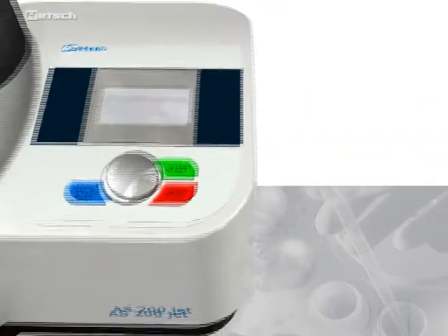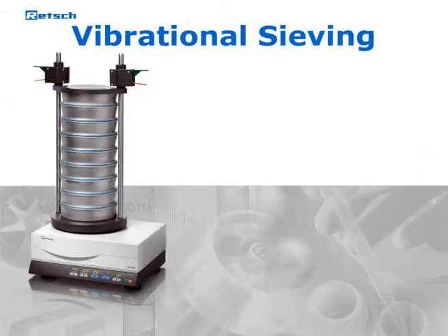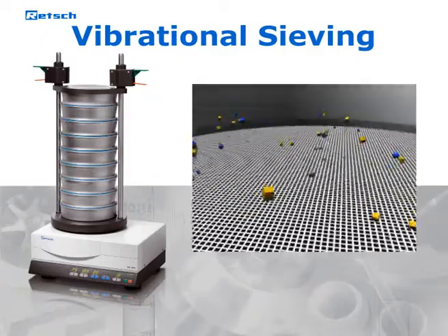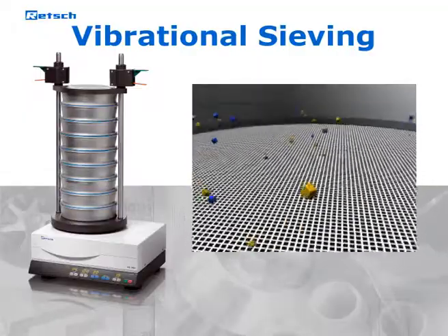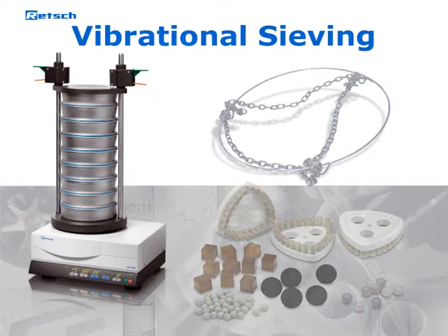As stated before, the AS200 Jet is ideally suited for very fine powders which tend to agglomerate and are only insufficiently separated by vibrational sieving. Traditional vibratory sieve shakers throw the particles upwards, allowing them to change their orientation. Particles which are smaller than the sieve apertures pass the sieve mesh due to their accelerated mass. For breaking up agglomerates, the use of sieving aids such as chain rings or steel balls is helpful.